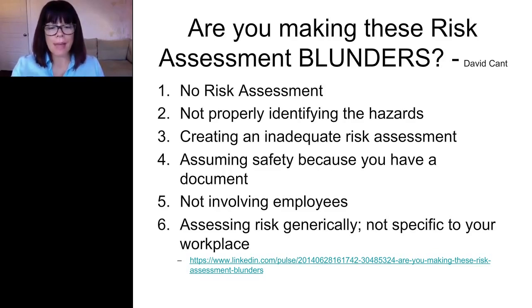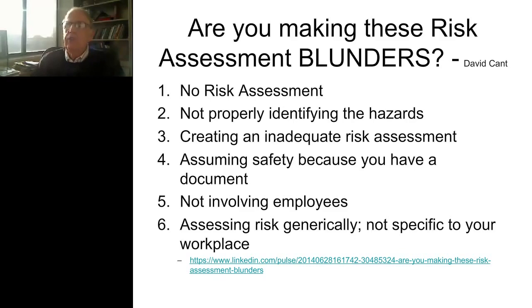Do some labs include biosafety competencies in the annual competency assessment program? It's a really good idea. Just like we have competencies for using instruments or performing tests, we should have competencies for biosafety as well.